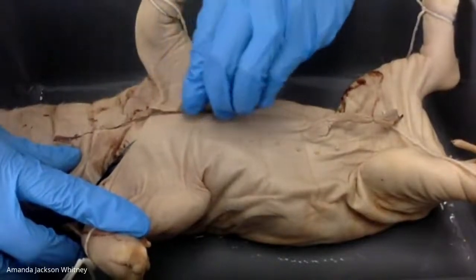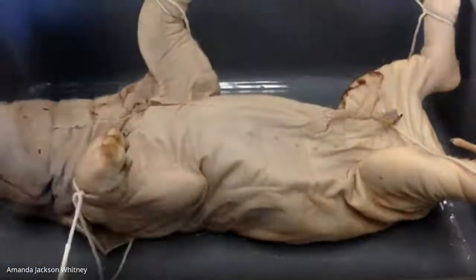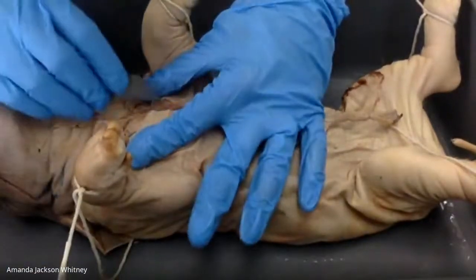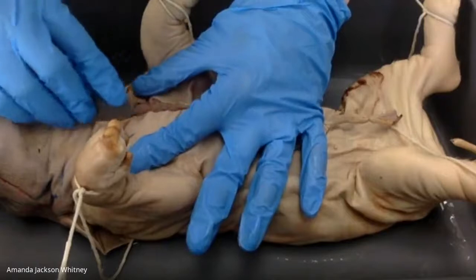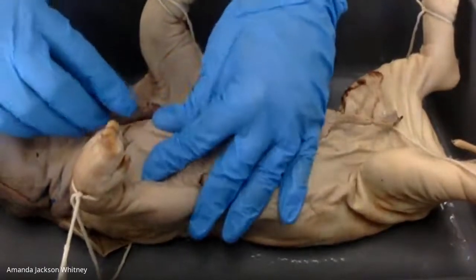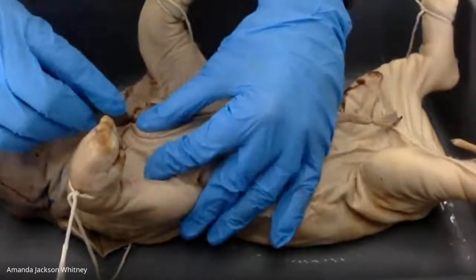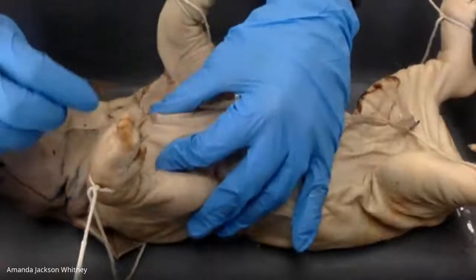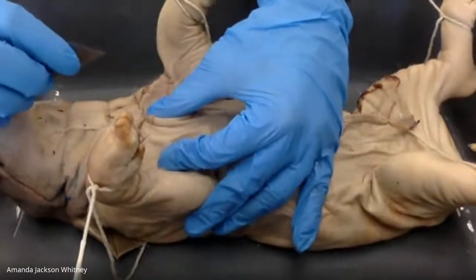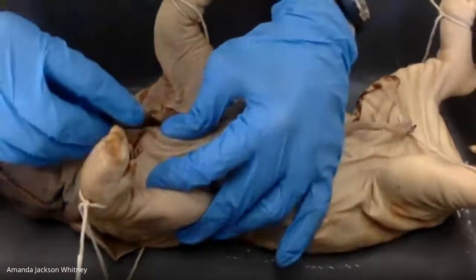So what am I going to have to cut through, like down here? You're going to have to cut through... Yes, the sternum.